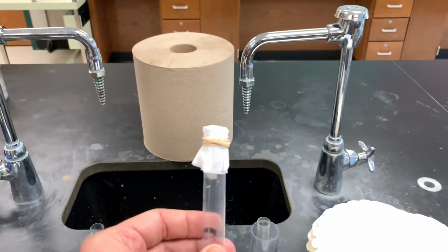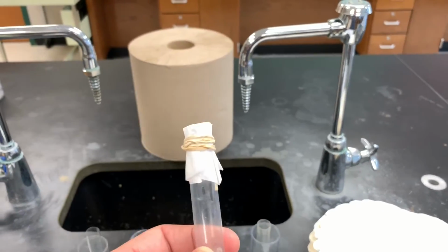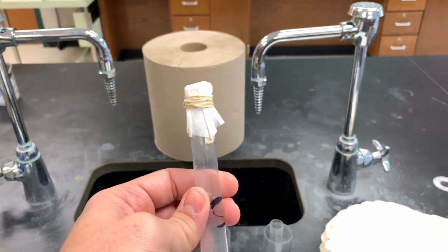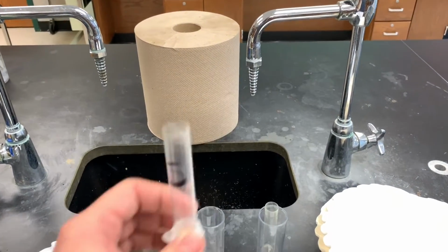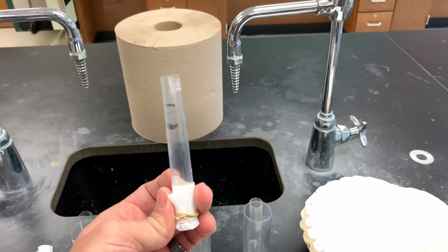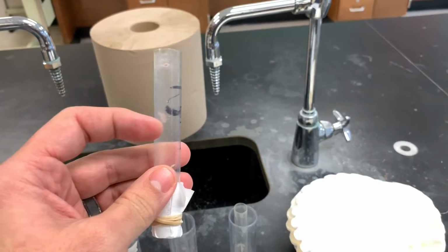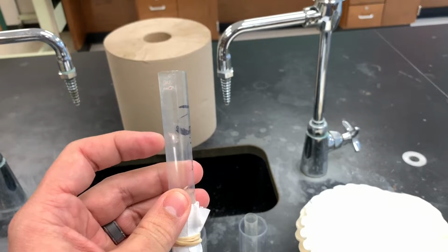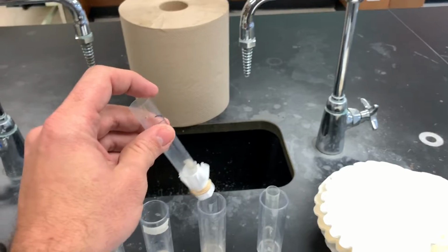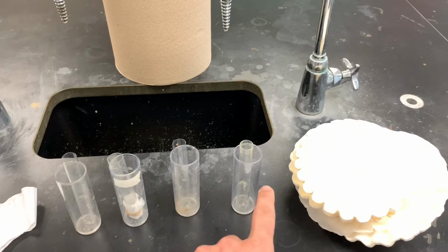So this is what it looks like when it's done. You'll wrap it with a coffee filter and then wrap a rubber band around it. You want to choose a rubber band that is fairly small. It makes this a little bit easier to do, so that the other side is open. And then you're going to fill in each soil sample. One will be filled with sand to 7 centimeters. The lab says to do it to 7 centimeters, so you'll want to take a ruler and measure where 7 centimeters is. That's where you'll fill your soil sample up to. And then you'll do this for clay as well as humus.